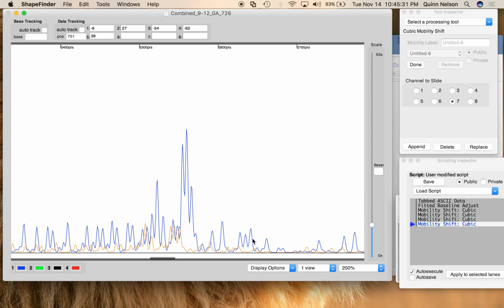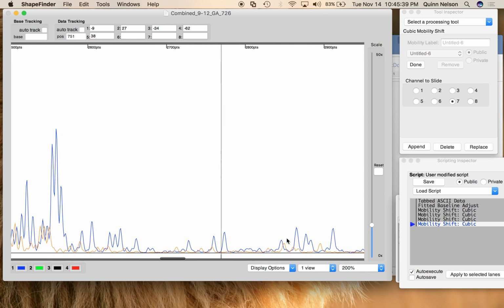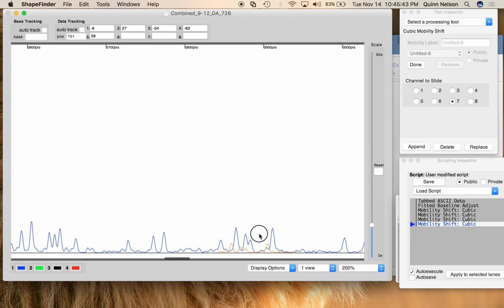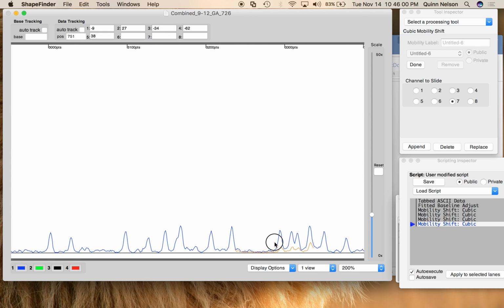And that's what makes it harder with the data at the end of these files, because there's no distinct peaks and they're not worth stressing over. So again, right at 2,800 to 3,000 data points, it starts to stop producing some good data, which is kind of where we're at. So we'll keep aligning as much as the orange lets us.